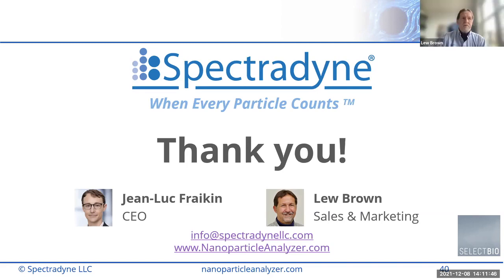Hopefully that happens. Another part to that question, which is implied to me, and I could be just overinterpreting because that's what I do. But one of the things that Jean-Luc didn't mention is that part of the microstructure of the cartridges themselves is that they have built-in filters. So you can imagine all the particles flowing through these nanoconstrictions.